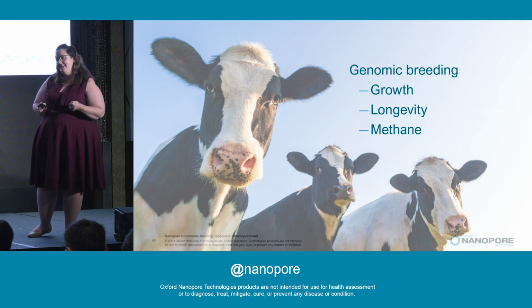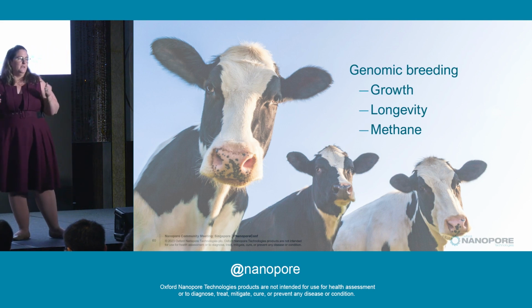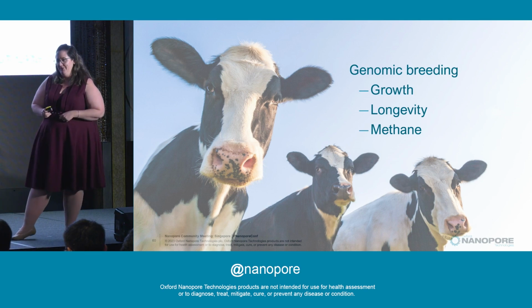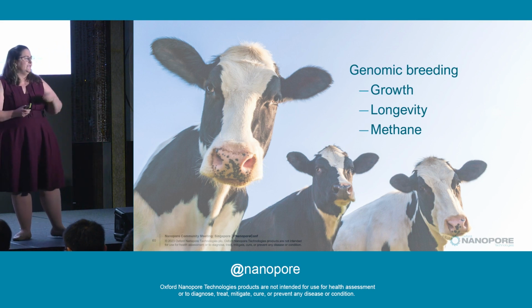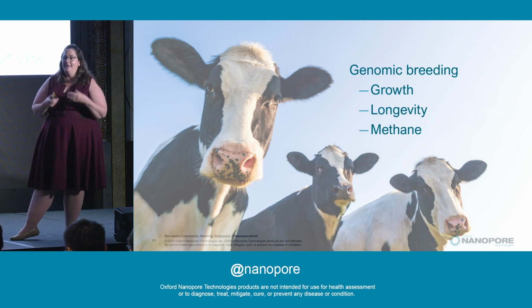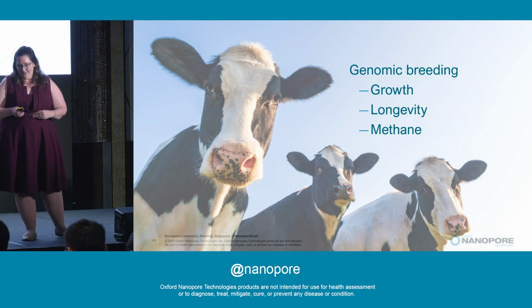You can take a piece of DNA, you can genotype that DNA, and you can know, what do you want to do with that animal? Do you want to keep it? Do you want to breed from it? Is it worthwhile for you? And we can do this for all kinds of traits. We can do it for growth rate, we can do it for longevity, we can do it for fertility metrics, things that it's impossible to measure on live animals. And we can also do it to methane. And I'm going to come back to the methane story later on.